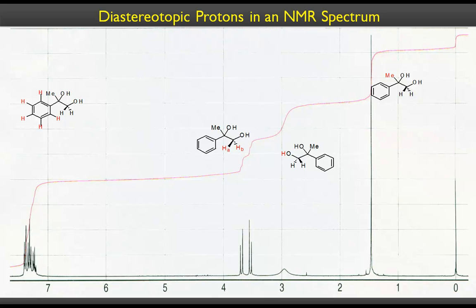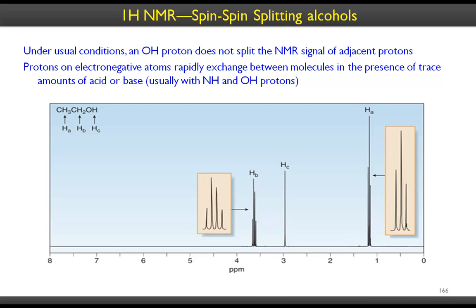So any questions? If not, we'll just move forward and take some examples. And as I said, hydroxy proton sometimes does not couple with others, so it just comes as a singlet, as in this case. But in some cases, some solvents do limit the hydrogen bonding, and then that does show up. So depending upon the solvent, depending upon the concentration, for now we can probably safely say the hydrogens that are attached to heteroatoms need to be taken carefully. Okay.